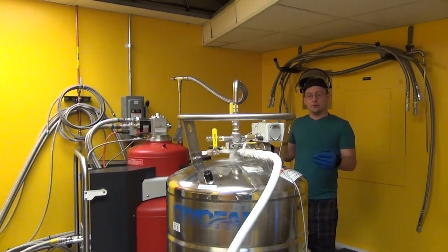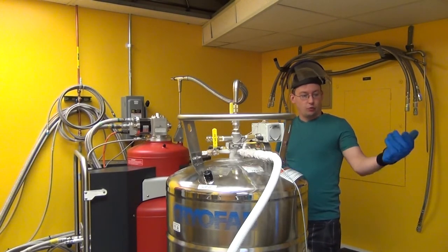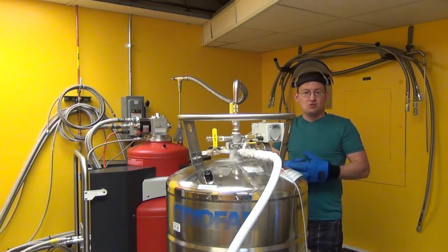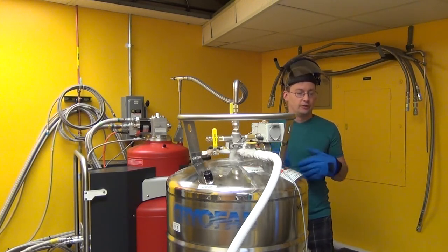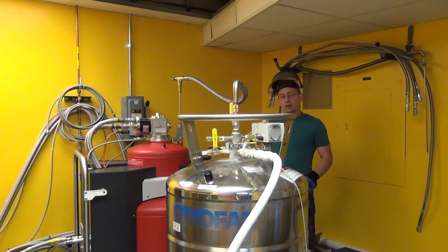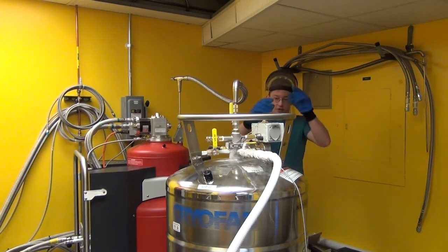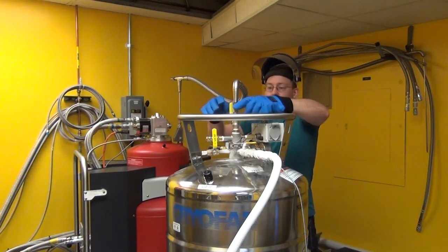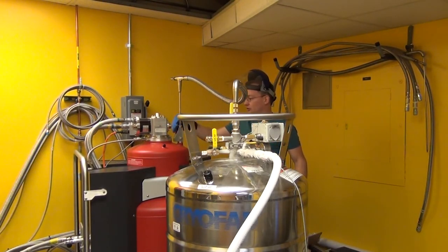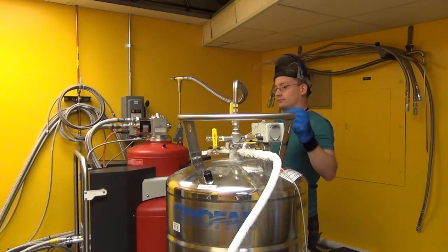We've been letting the helium transfer for about 20 minutes. According to our gauge, we're at 20 and a half inches — I like to shoot above 20 inches, which gets you over 90 liters. We'll call that good. So now we've got to stop the transfer. The first thing I did is put it back to transfer slow so we have the lowest pressure on the Dewar. Now we're going to loosen just the top screw cap on each end of the transfer line.